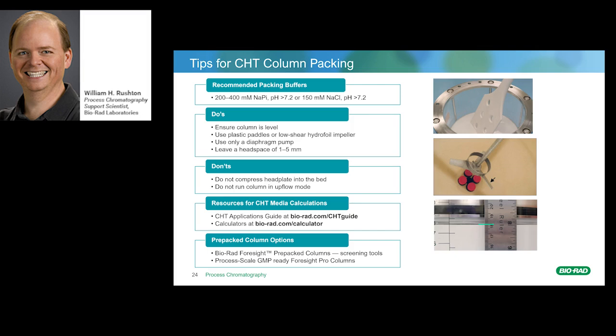This will then lead into some of the don'ts. You don't want to compress the head plate into the bed. If you do so, you could damage the particles, which could lead to increased pressure as the broken particles fill in those interstitial spaces. You don't want to run the column in upflow. Again, because of this headspace, if you run an upflow, the entire bed will lift up, and this would ruin the pack.